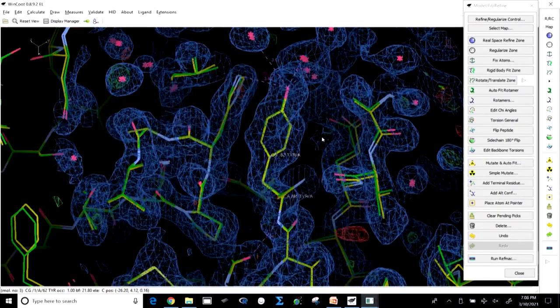mutation. So, what have we learned now? We have learned how to load the PDB file, and how to load the electron density map, and we have seen the difference in the map. When it is normal, it shows blue color. When it is wrong, it has either red or green color. When something has to be put somewhere but people have not modeled it, it will be green. When they model it but it should not be modeled there, they would get red color, right. Now, we will see the thing which is called mutation.